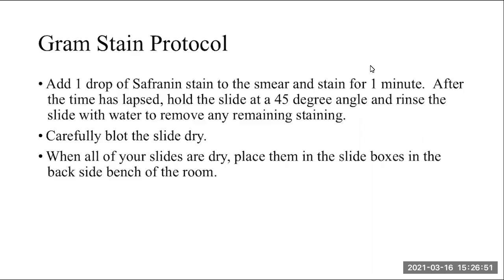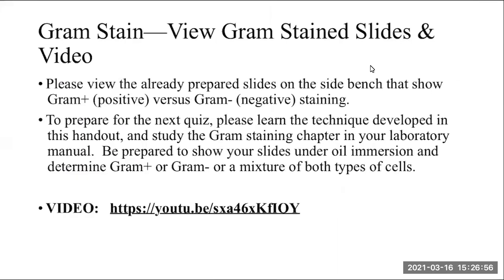Then you place them all in slide boxes that would have been identified. Then you would view the Gram stained slides under the microscope the following week. We always allow them to completely dry, because if they're not completely dried, they look funny under the microscope. We don't usually look at them the same day, because sometimes they're not very well dried, since they have to completely air dry. That's why we always push the viewing off to the following week.